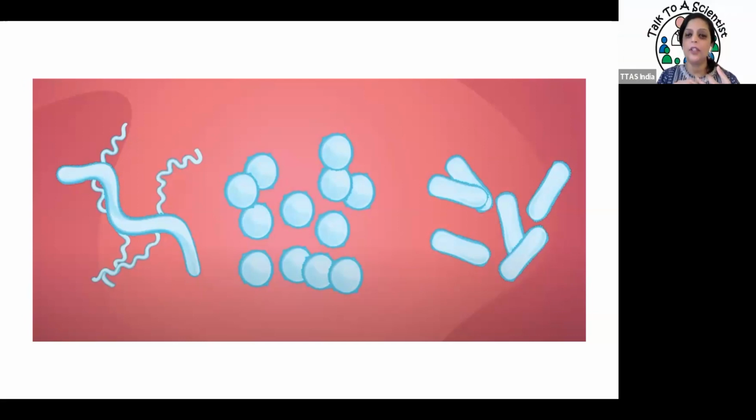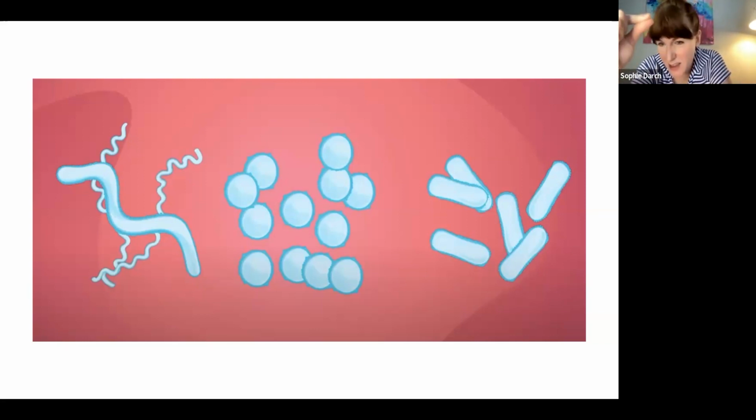Sure. It's something that Manu Prakash at Stanford came up with: a paper microscope with a lens, which you could use to look at river bacteria or larger bacteria in rivers and things like that. But there too, Kavish, just to answer the question, you can keep some distance. So it's like a mobile microscope, basically, Sophie. Yeah, I see what you mean. I think I remember having one of those at one point. For the physics of it, which we're not going to get into today, you definitely always have to have some distance. So even though you might not think there's a distance, there is, in terms of what's protecting you.